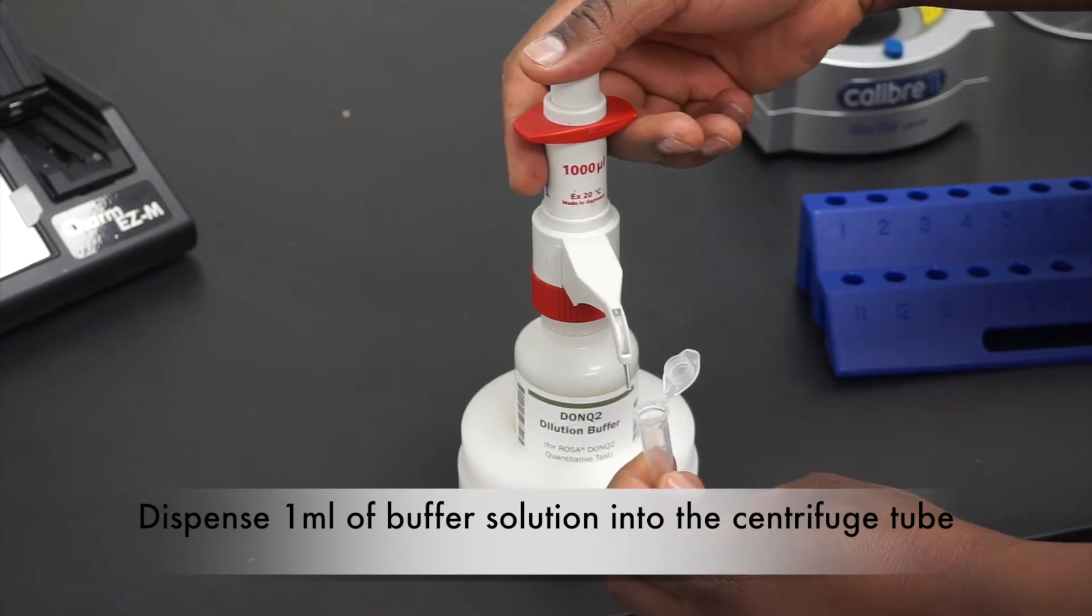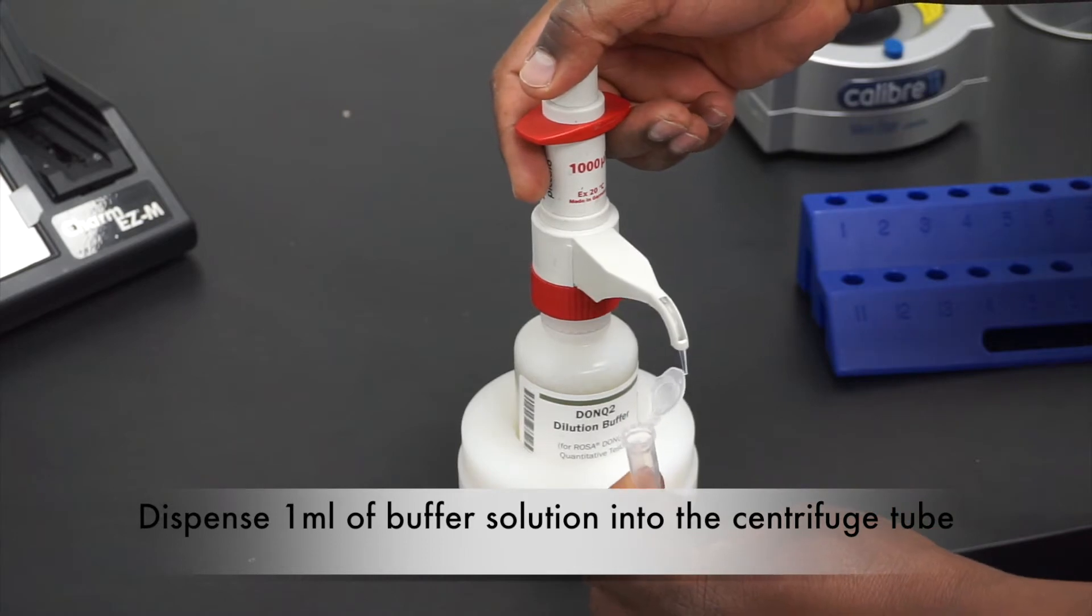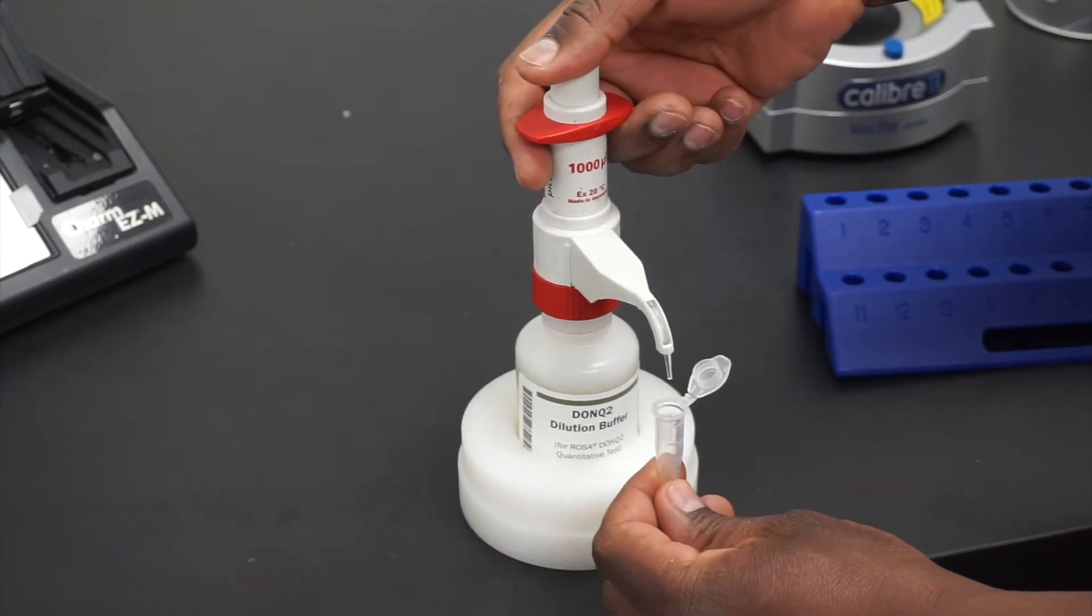To start with, dispense one milliliter of DonQ dilution buffer into a centrifuge tube.